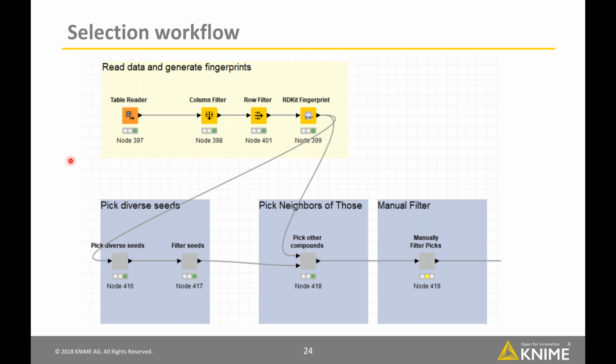We've now flagged the compounds that we believe don't have any of the flags that would indicate that they're likely to have problems in the high throughput screen. Now what we're interested in doing is taking those cleaned up hits and picking the compounds that we're going to move forward for the validation assay.